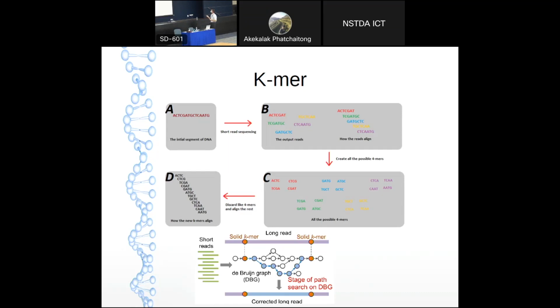Okay, so we have these shorter overlapping reads, and you can see how they overlap here. The idea then is to break these down further into much shorter fragments, which sounds counterintuitive considering how problematic repeat sequences are, but it seems to work pretty well. It's a trade-off between computing time and accuracy.